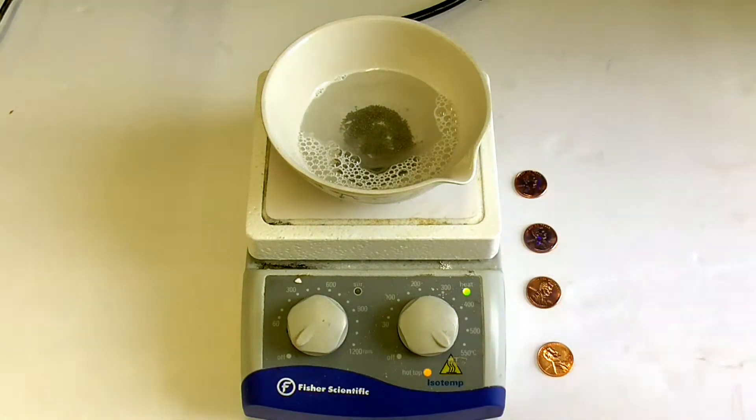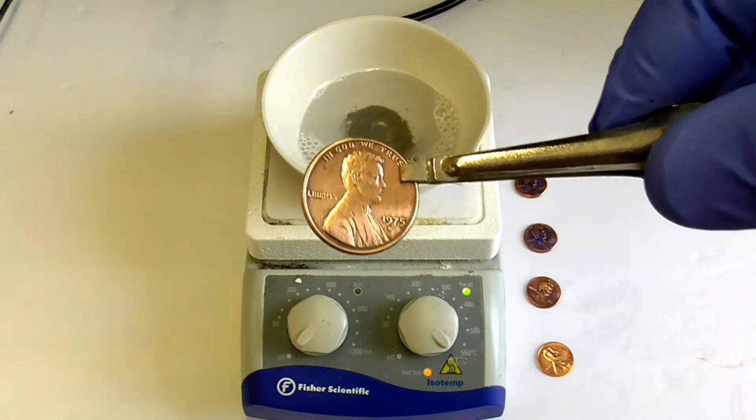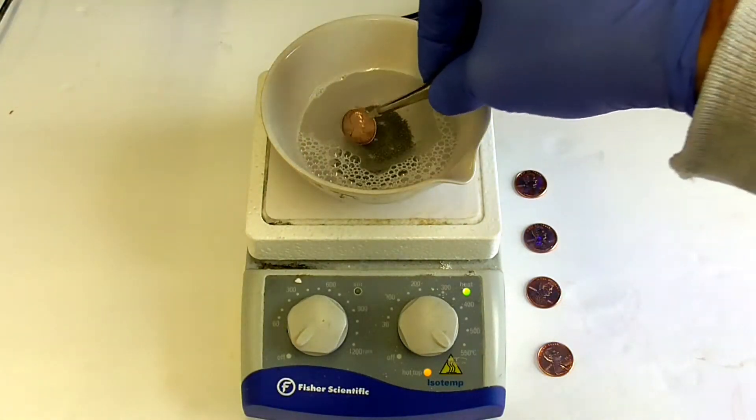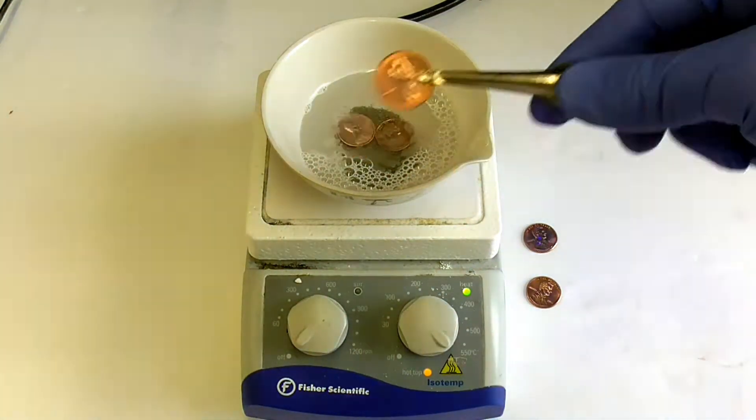The mixture should be heated until it simmers, then add some pennies. Before you add the pennies, it's best to shine them up by buffing them with some steel wool to get them nice and clean. It takes about 10 to 15 minutes for the tin to plate onto the pennies.